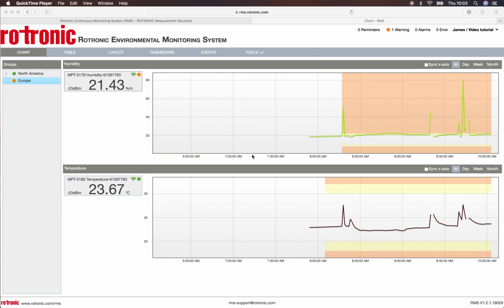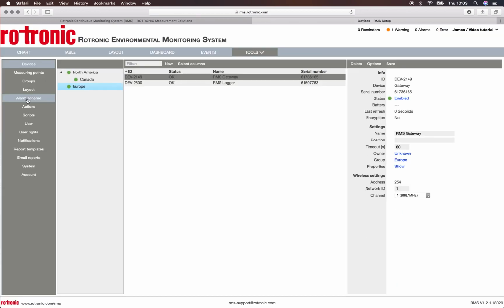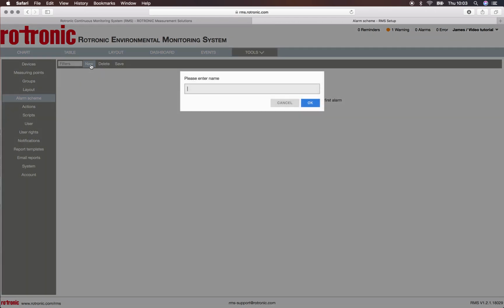In this video we'll be showing you all about the alarm schemes. In order to access the alarm schemes we go to Tools and Setup. Under Setup on the left side you can see Alarm Schemes, and here we will create a new alarm scheme. Please enter the name.